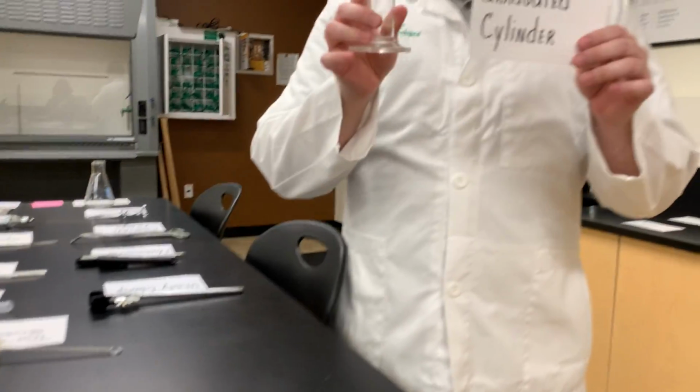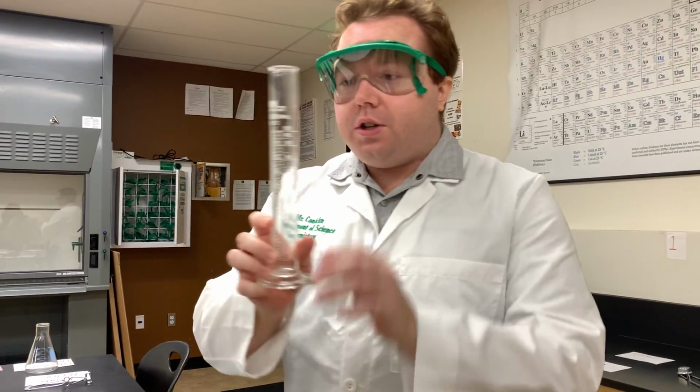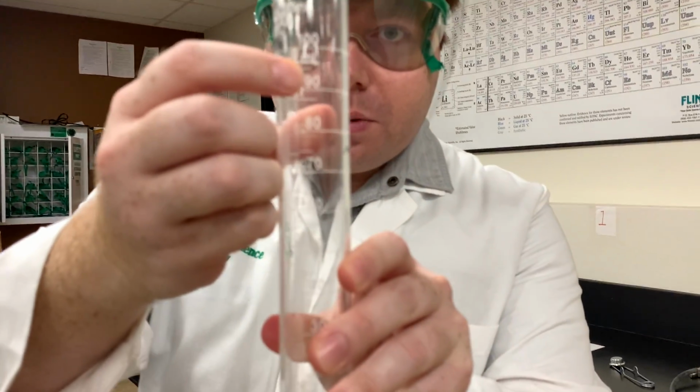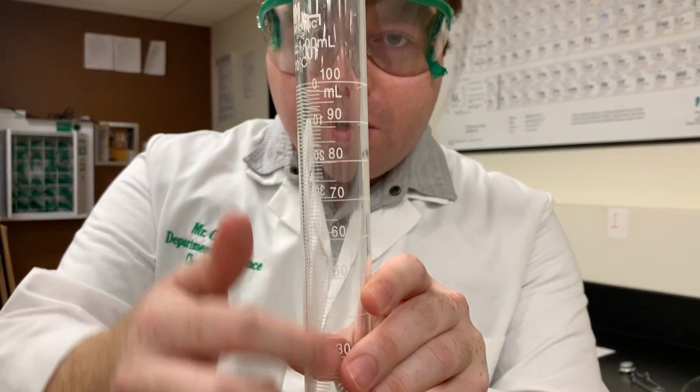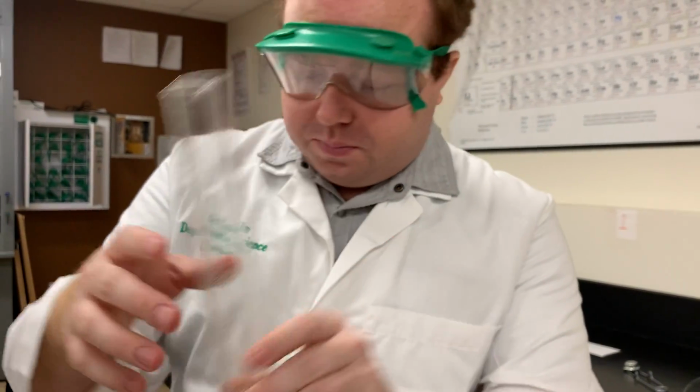It's a cylindrical glass tube with graduations and measurements on it. We use this to measure out liquids. And as you can see on the side here, there are different measurements from 0 to 100. It measures in milliliters the amount of liquid that you can get.